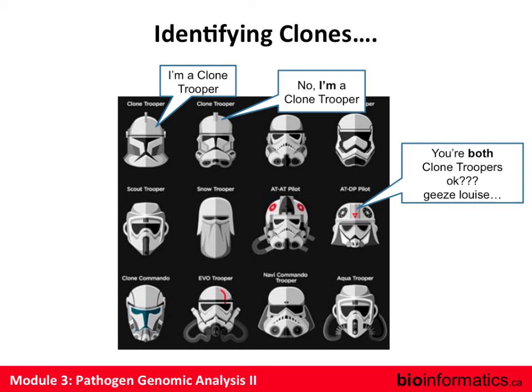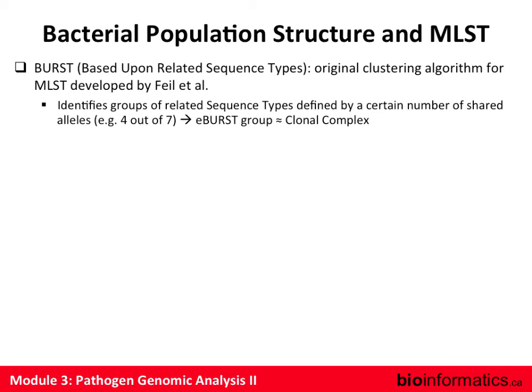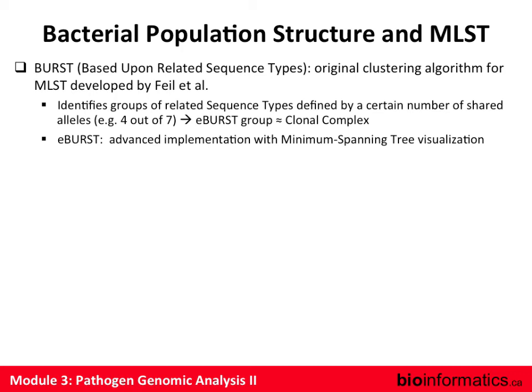Now, in order to analyze MLST data, we use this approach called BURST, or Based Upon Related Sequence Types. It was an algorithm that was developed in the early noughts. And it is all about trying to figure out these clonal groups or lineages. It's undergone some refinements. eBURST was the first iteration, and then we have a goeBURST algorithm now.